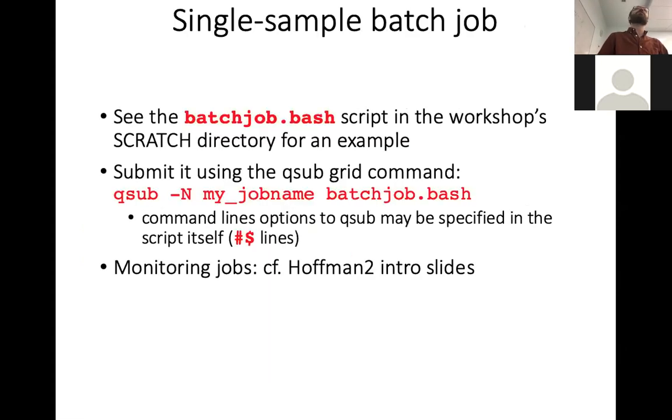And then I had a section on running batch jobs on the cluster, which is going to be more difficult than running regular commands. It's just going to take time between every try you make, and this is just trial and error. I've put an example in the workshop directory.